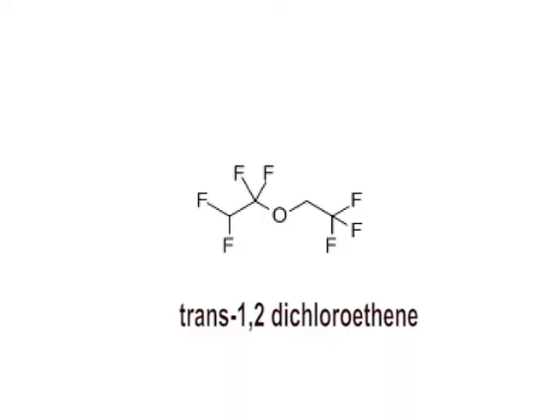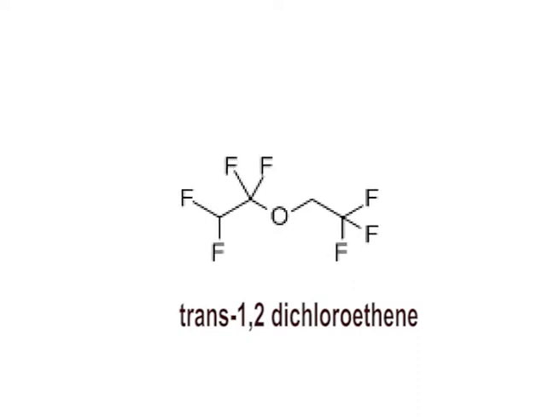Lately, however, this compound has been banned due to its role in depletion of stratospheric ozone. Methanol, acetic acid or petroleum ether serve as alternatives. A mixture of hydrofluoroether and trans-1,2-dichloroethene is almost as effective as CFC-113. The following procedure, subject to minor variations, is normally adopted for developing latent fingerprints by the DFO reagent.